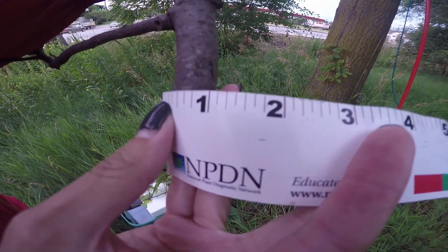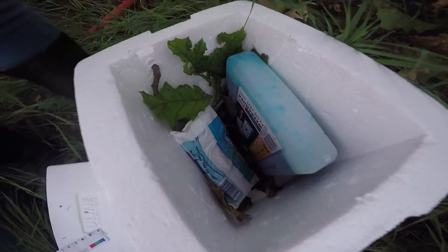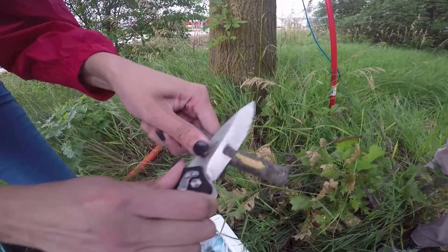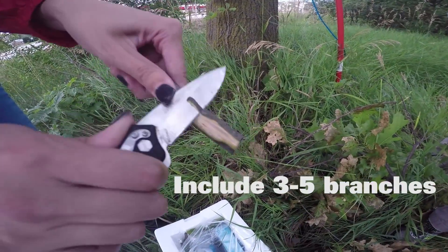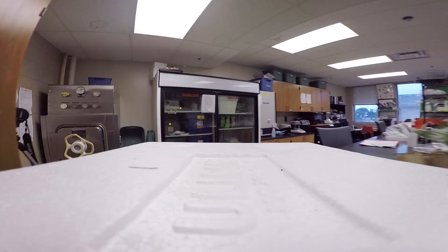Place your branches in the cooler and one by one use a knife to peel the bark of the branch, looking for staining on the sapwood. We need at least three to five branch sections that do have staining on the sapwood.